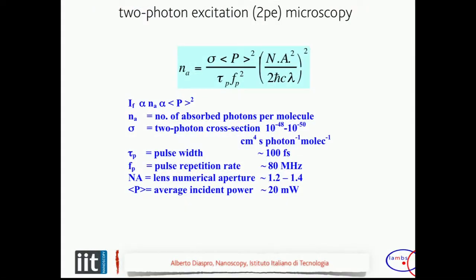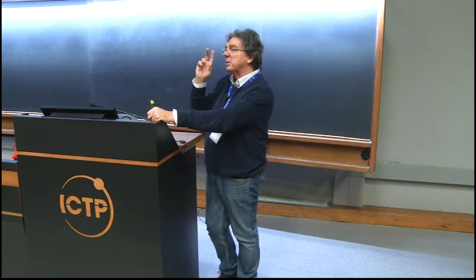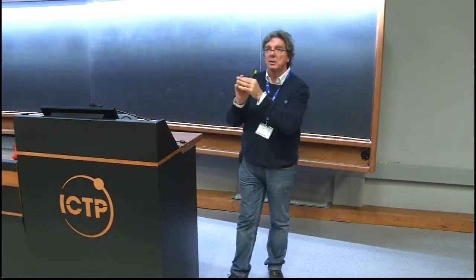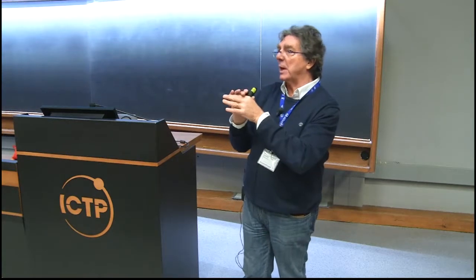And now there is another aspect that is interesting in terms of the fluorescent molecule and the sample, and it is related to cross-section. I never found papers related to the prediction of the two-photon cross-section, maybe only for one specific molecule under very specific conditions. Modeling this is very complicated, and you cannot predict them. You can only measure this.